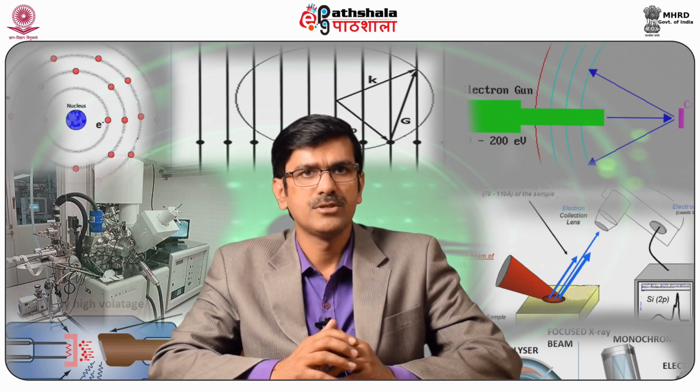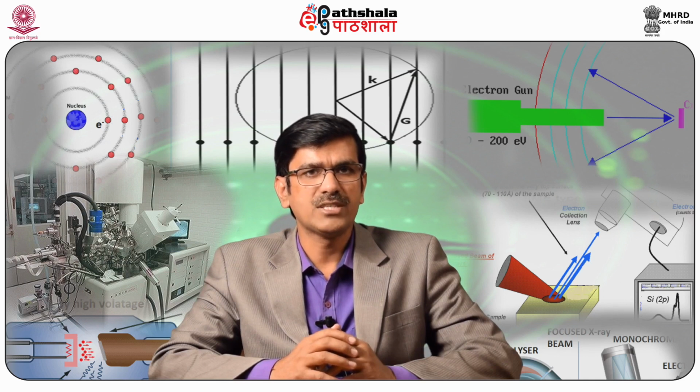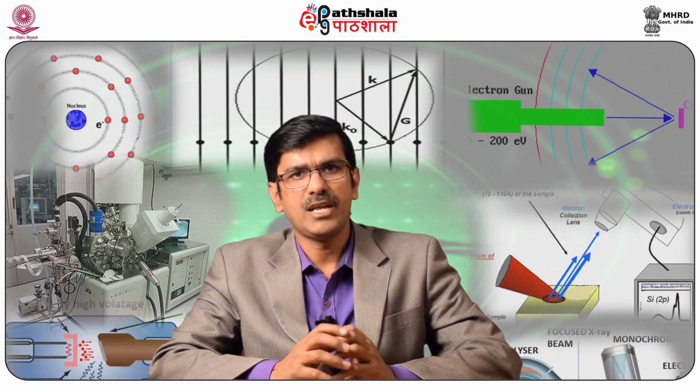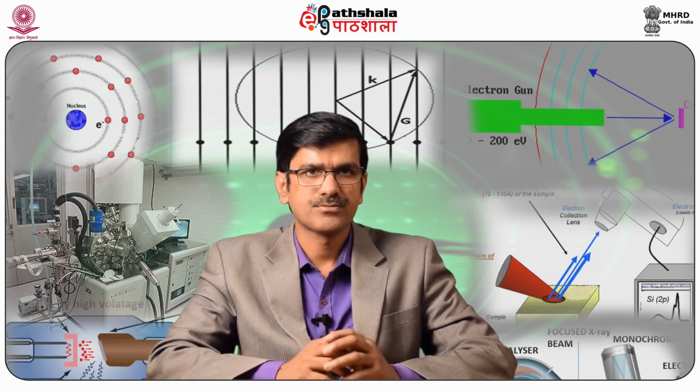It controls the acceptance angle. This has obvious applications in defining the angular resolution for angle resolved XPS, and it is also important for small area and imaging XPS because the angular acceptance will determine the spatial resolution as well as the transmission.